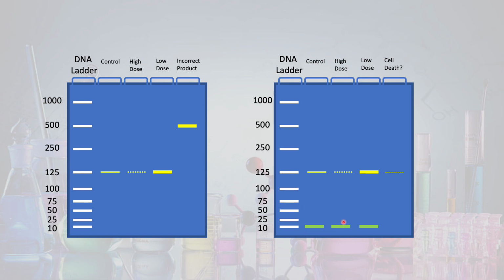In our high dose toxin treated group, this is the amount of housekeeping mRNA that's being transcribed, and then the same for our low dose toxin group, right? And so when you guys go to quantify this, you'll literally be comparing the pixel intensity from the band of our gene of interest to the band from our housekeeping gene.